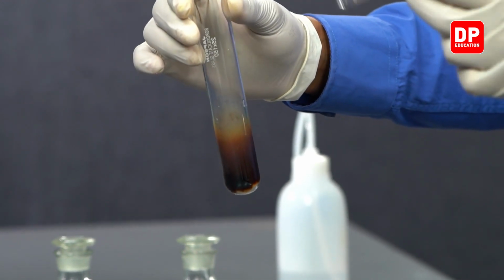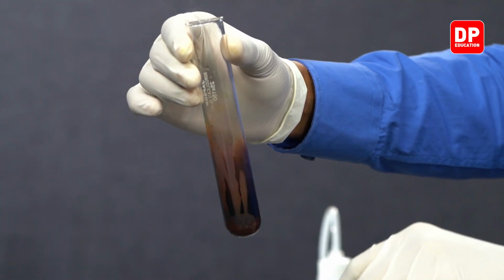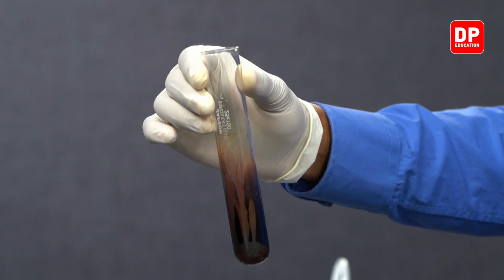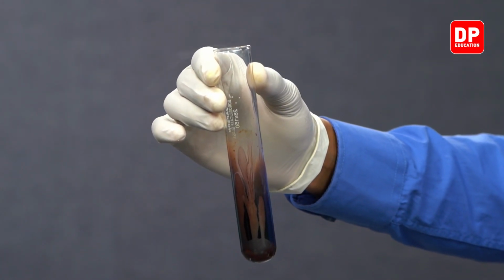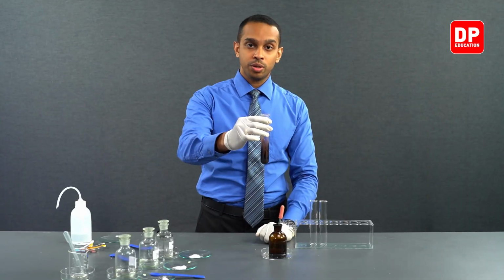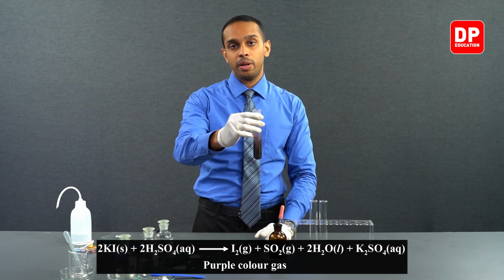As you can see, when we are adding concentrated sulfuric acid onto this potassium iodide solid, a purple color gas formed. You can see that the interior walls are also turning purple due to that gas being formed. This is due to the release of iodine, or I2 gas. I2 gas is purple in color.